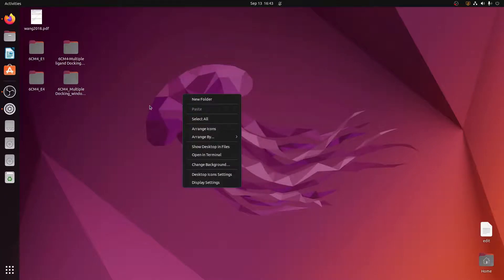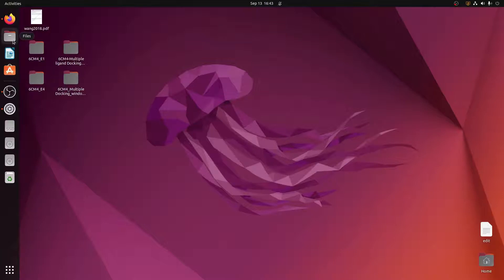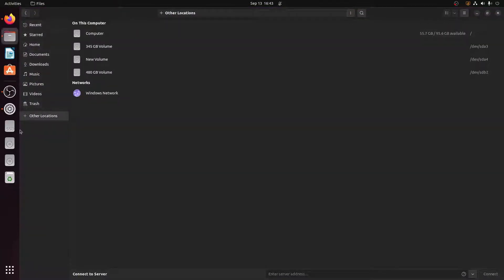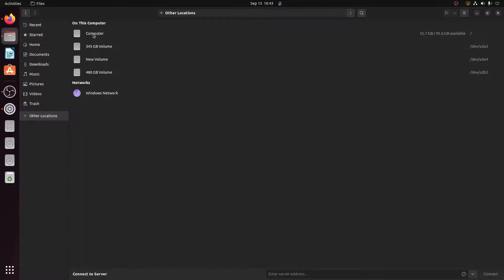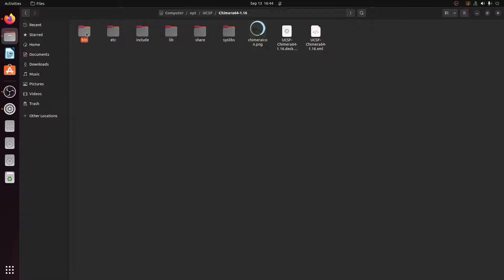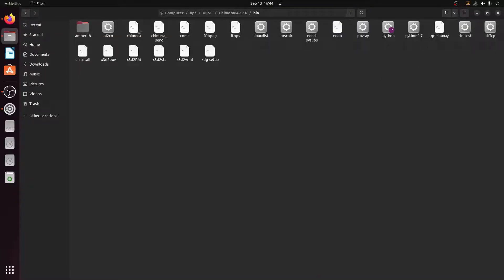As shown in my previous video, Chimera gets installed into the root directory. So first let me go into the root directory — I'll go to the Files icon, go to Other Locations, and click on Computer, which takes me to the root directory. Once here, I have to search for the folder where Chimera is installed. In this root directory, Chimera is installed in the folder called 'opt'. Inside opt there is a folder called 'ucsf', inside that a folder called 'chimera', and inside that a folder called 'bin'.